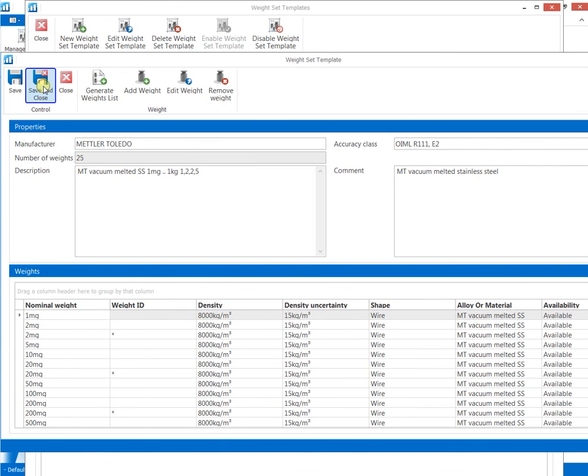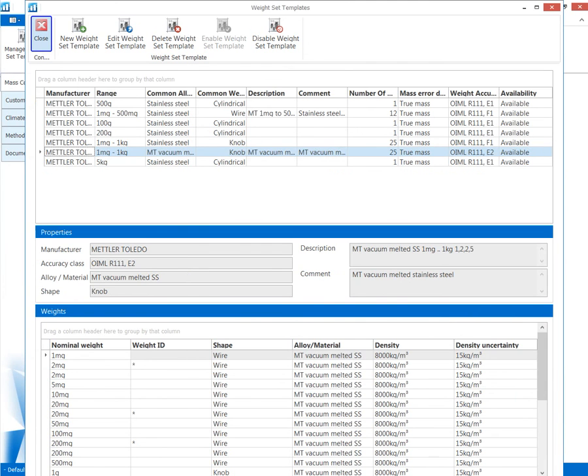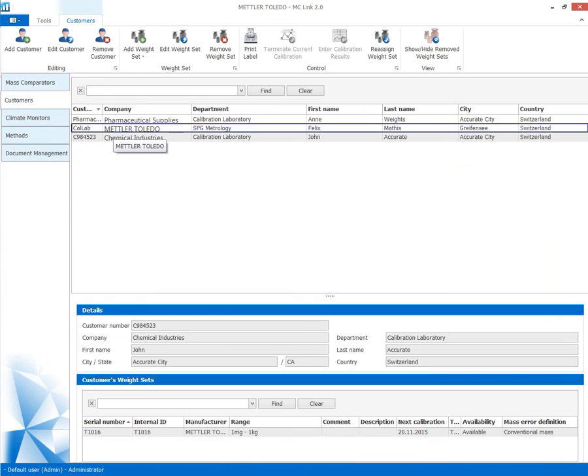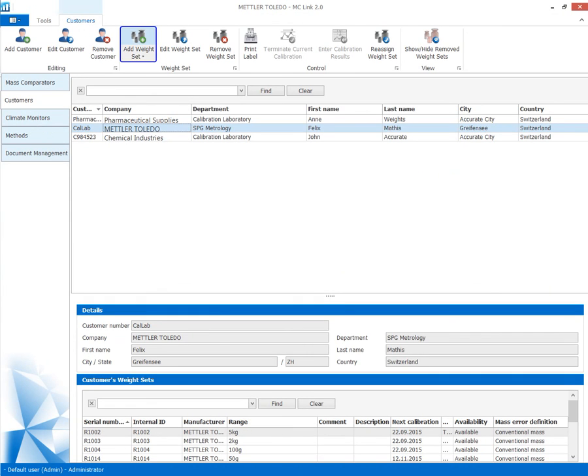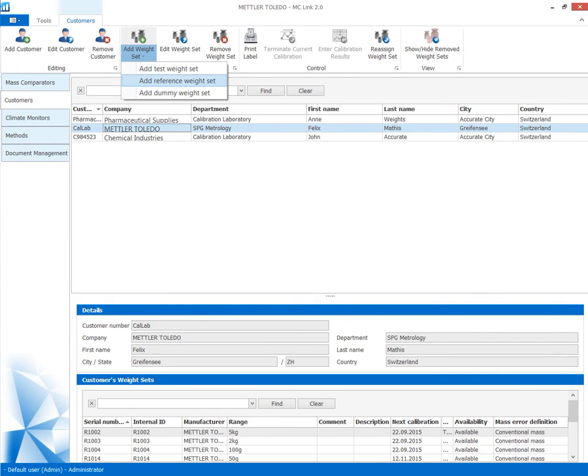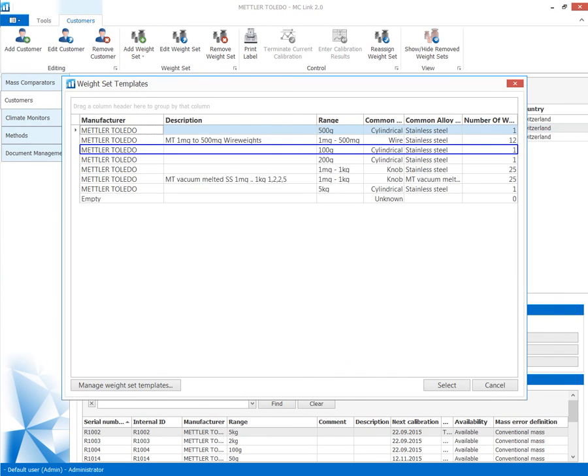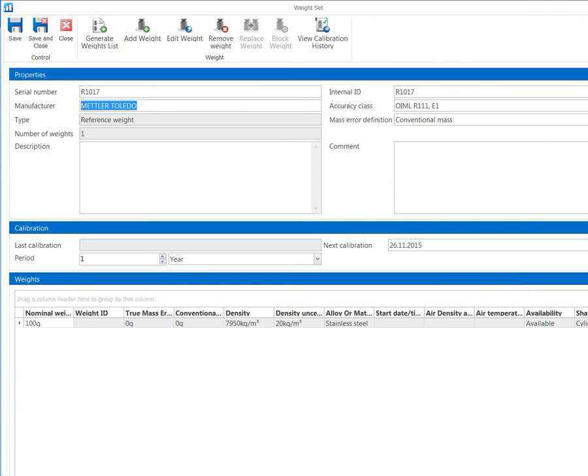Reference weights are defined with weight set templates and completed by entering data from the calibration certificate.